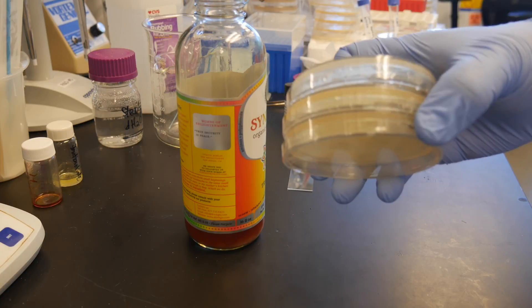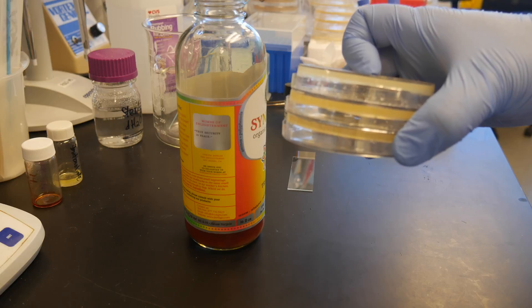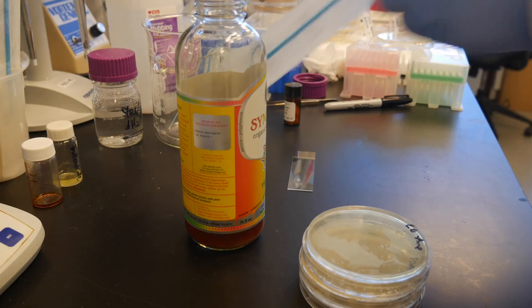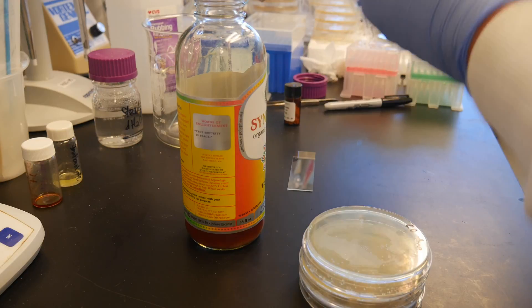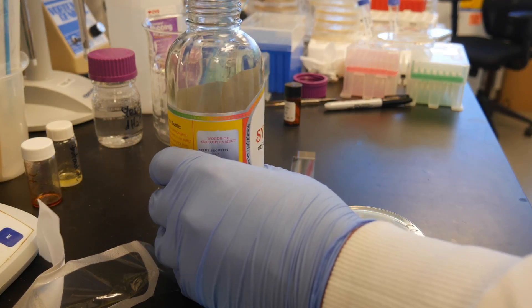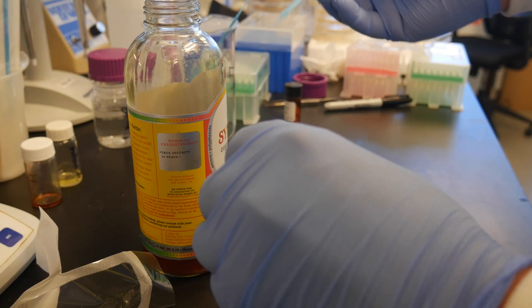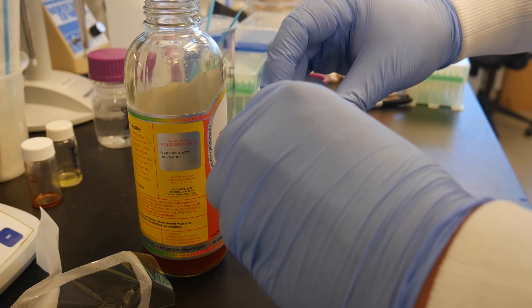That's it. We'll incubate these at between 30 degrees for the PDA plate with the yeast on it, and 37 degrees for the Bacillus plate. One other interesting thing we can do is take just a small amount, apply it to a microscope slide, and put a cover slip on.